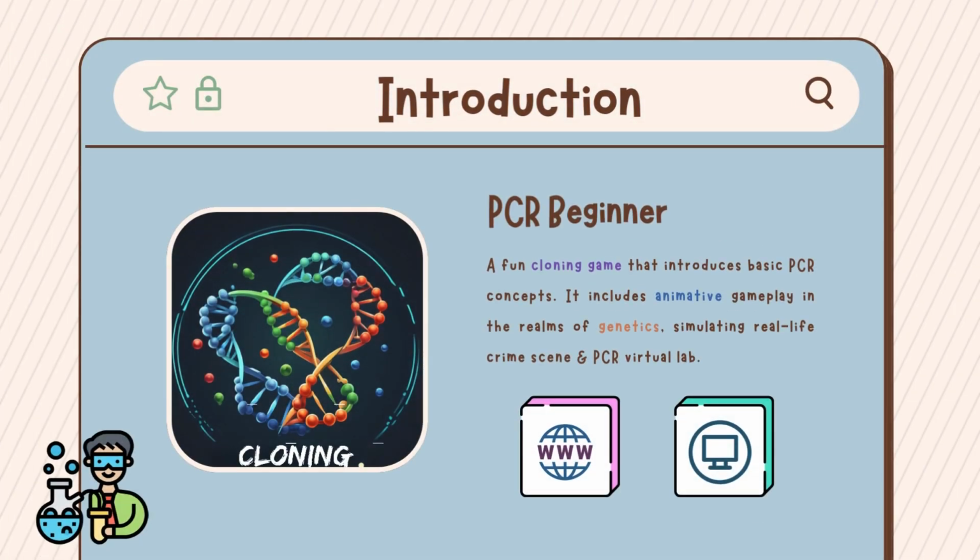A quick introduction of this project, PCR Beginner is an educational game that introduces polymerase chain reaction concepts, which PCR is actually a technique to amplify DNAs for DNA analysis. PCR Beginner contains interactive gameplay like crime scene simulation and PCR virtual labs, and it can be played on both web and desktop platforms.